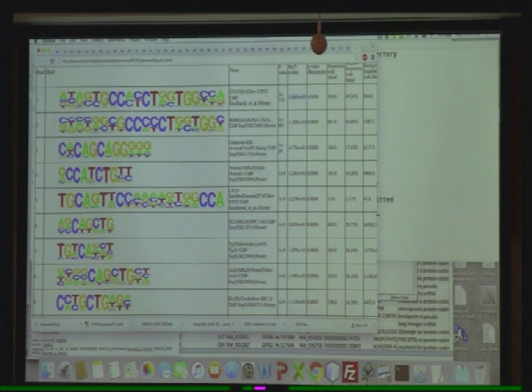So your input is the chromosome, and the start and stop are 100 apart. You can define exactly how much region you want to look at. But if you just want the default, a lot of these programs are very smart and will give you good results fast. So if you want to throw together a quick poster, just copy paste, p-value, great, publish.